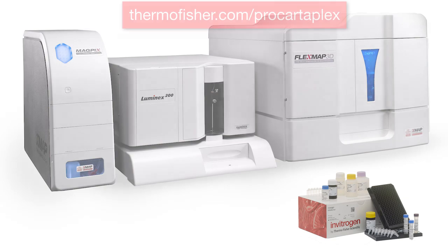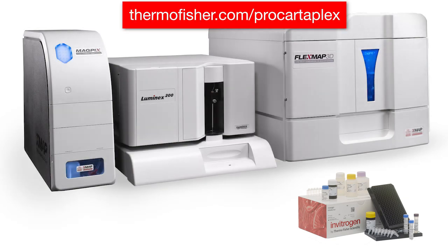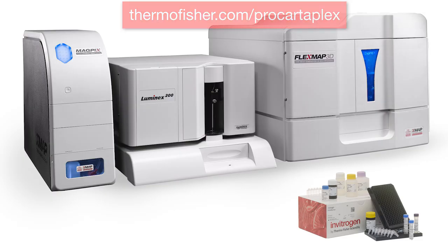Please refer to instrument user guides for applications involving the Luminex FlexMap 3D, Luminex MagPix, and Luminex xMap IntelliFlex instruments. xPONENT software settings for the ProcartaPlex assay can be found in the ProcartaPlex assay user guide.